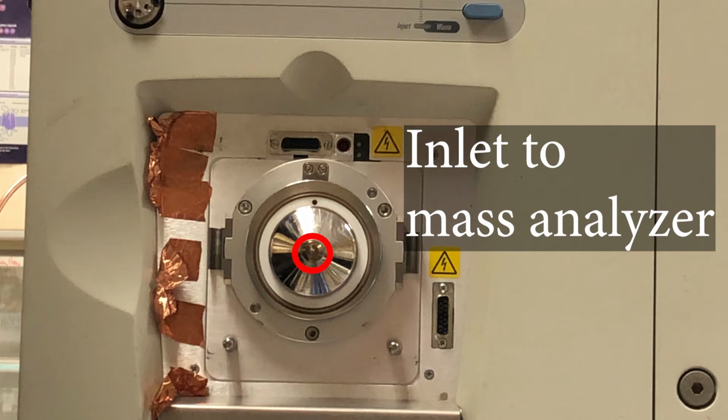So we're going to look at the cousin to this instrument, the one that you guys are going to do in LC Tox, and I want you to imagine that I took that whole circular part that's around the inlet and just pulled it out. So there was kind of a big hole in the front there. And we'll look at what it looks like from there.